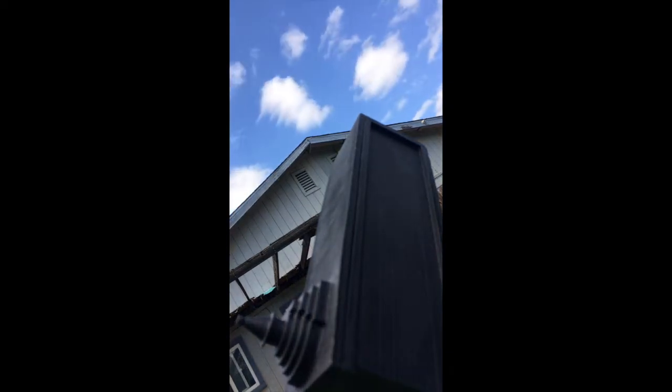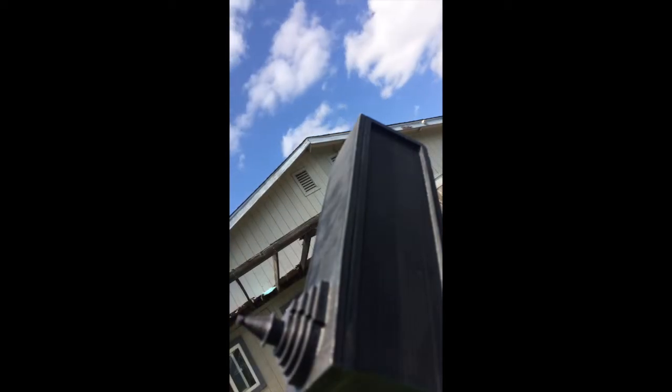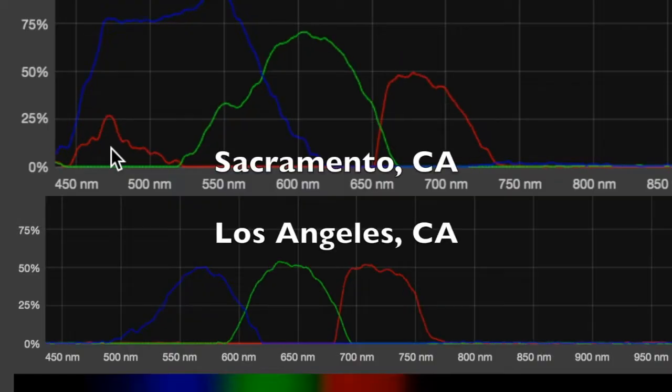Hello, my name is Yolanda Reyes, and for the MESA Professional Development Program, I designed an optical spectrometer called Xiuhtecuhtli. This instrument is used to survey the visible part of the electromagnetic spectrum. With this device, I'm able to collect data on many things such as air pollution.